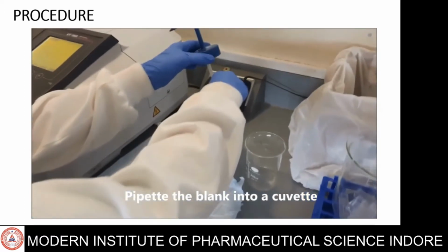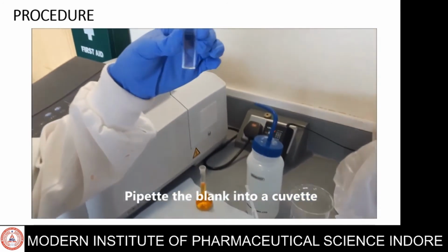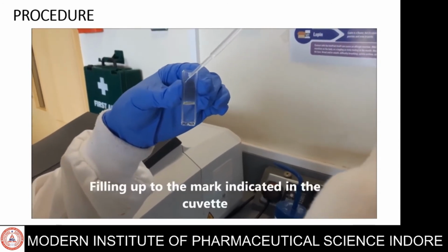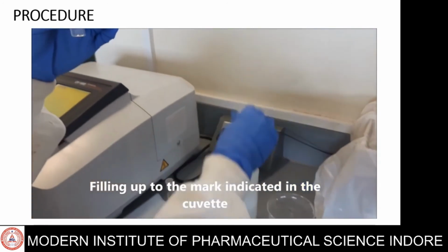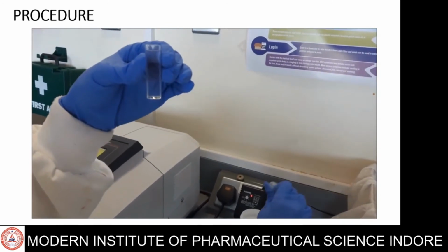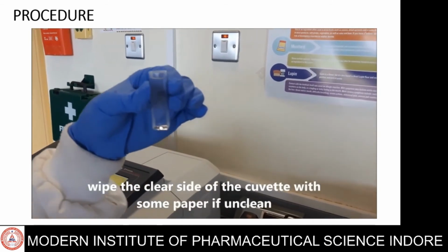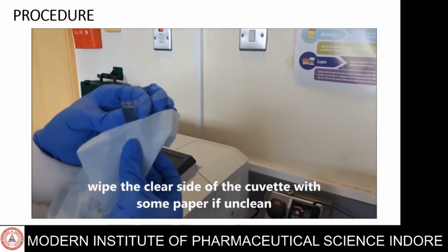Pipette the blank into a cuvette. These are the cuvettes which are used for analyzing the spectrum in the UV visible spectrophotometer. Fill up to the mark indicated on the cuvette. With the help of a micropipette like this, wipe the clear side of the cuvette with some paper if unclean.